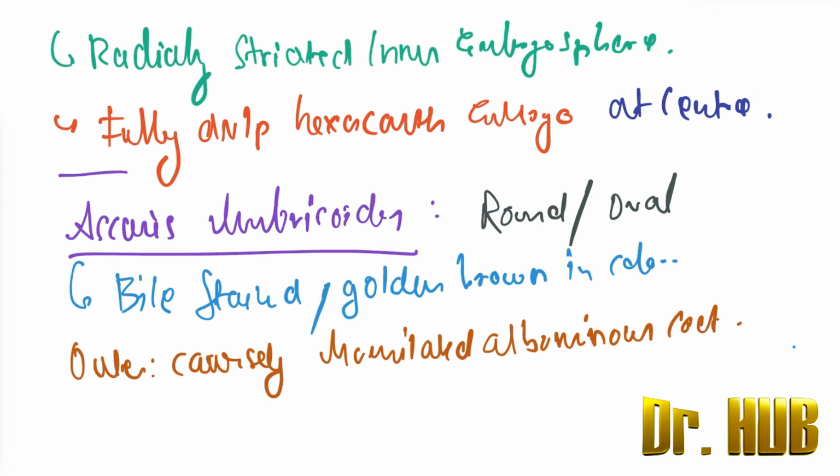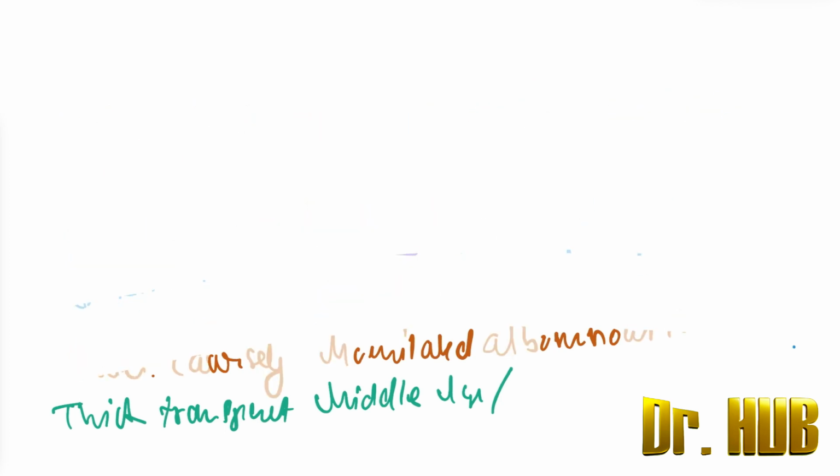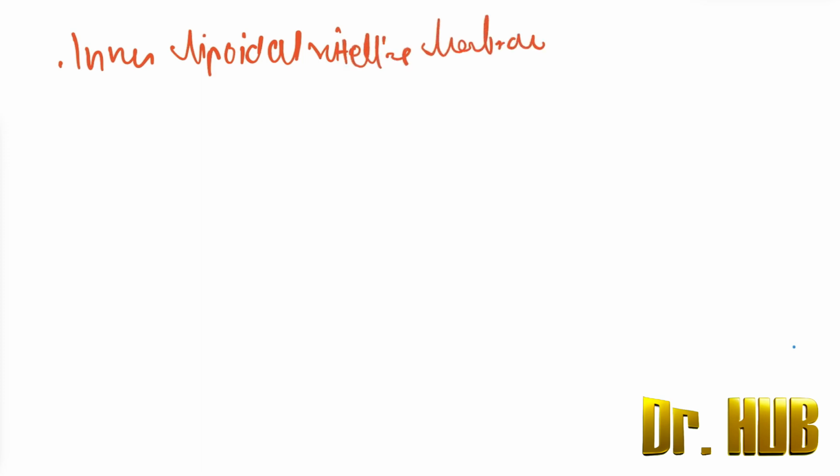There is a thick transparent middle layer, and an inner lipoidal vitelline membrane.